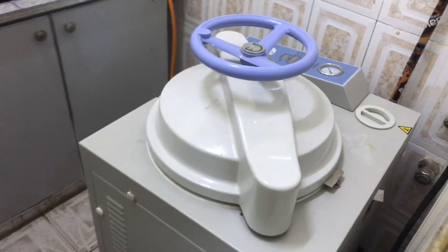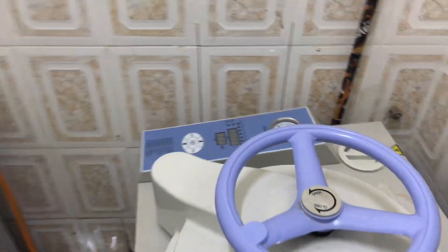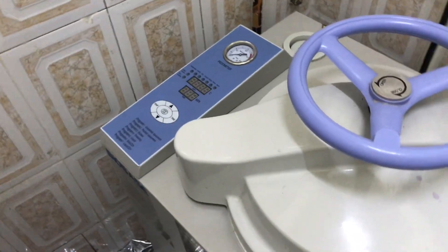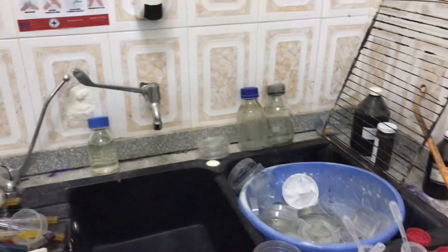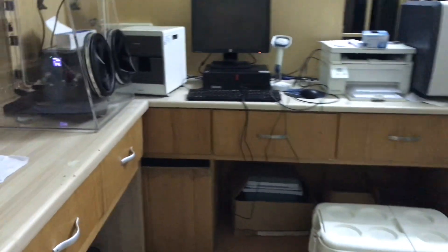In here we have an autoclave — of course every microbiology lab needs an autoclave — so that's our autoclave. And over here we do some staining. That is our microbiology lab for you.